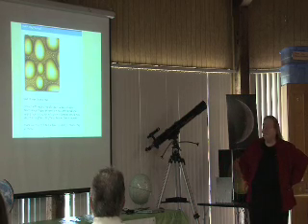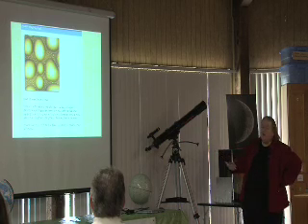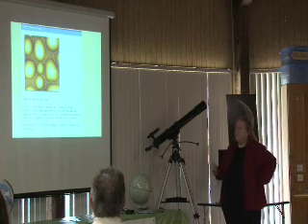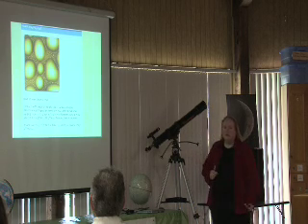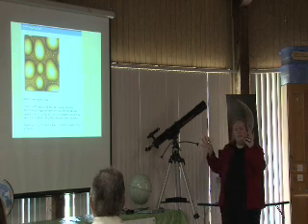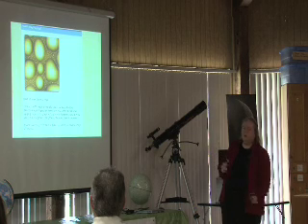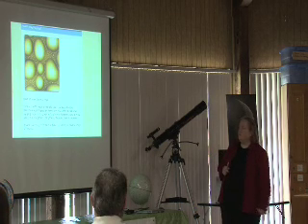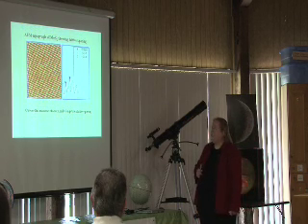It's glass. You see these big areas that are smooth and little smaller ones? Borosilicate. So there's a mixture of boron and silica, and they have these interesting particle arrangements. So you can look at composite structures of different kinds of atoms and elements that are together. So this is 30 by 30 microns for the whole view. And that's what glass looks like under an atomic force microscope.